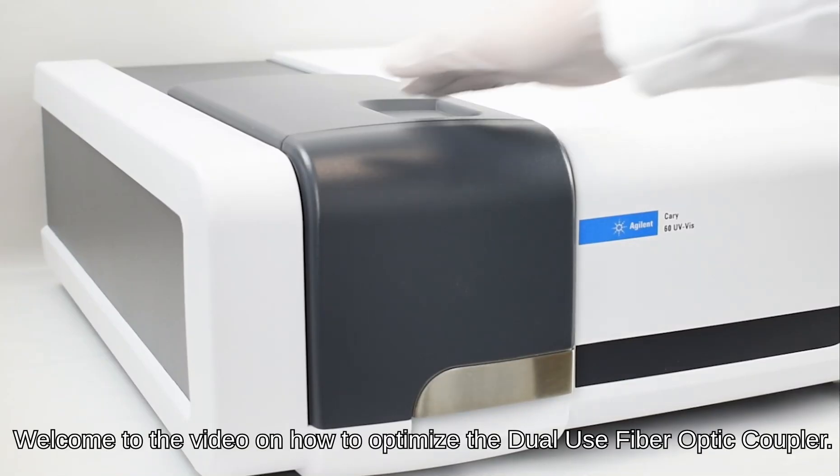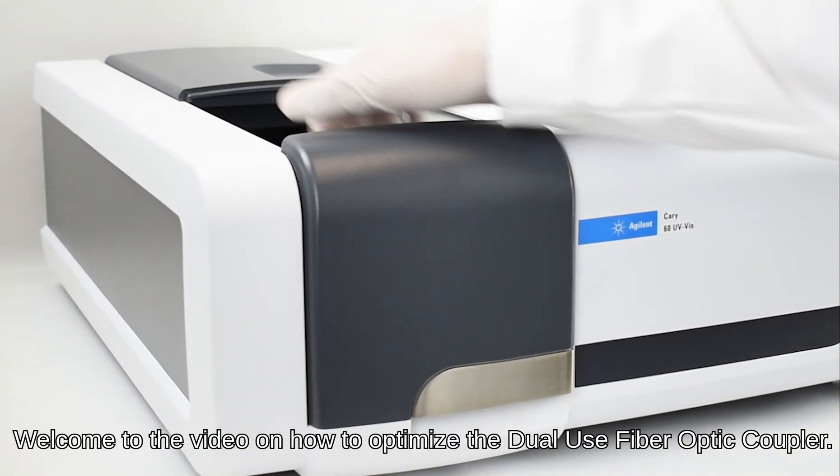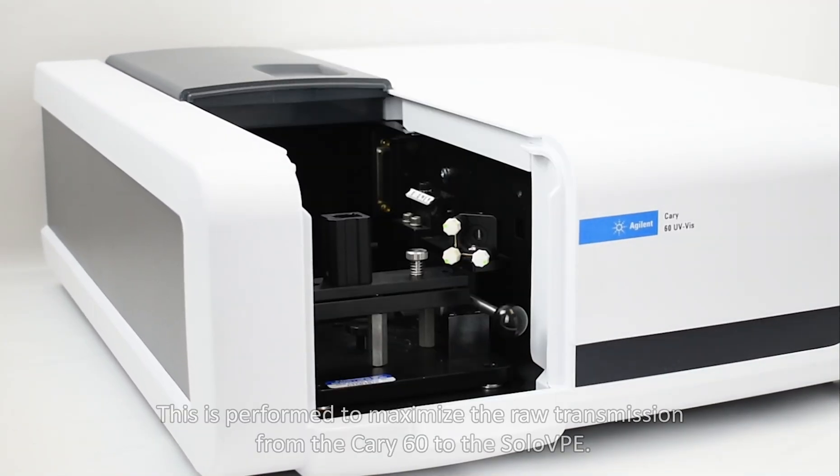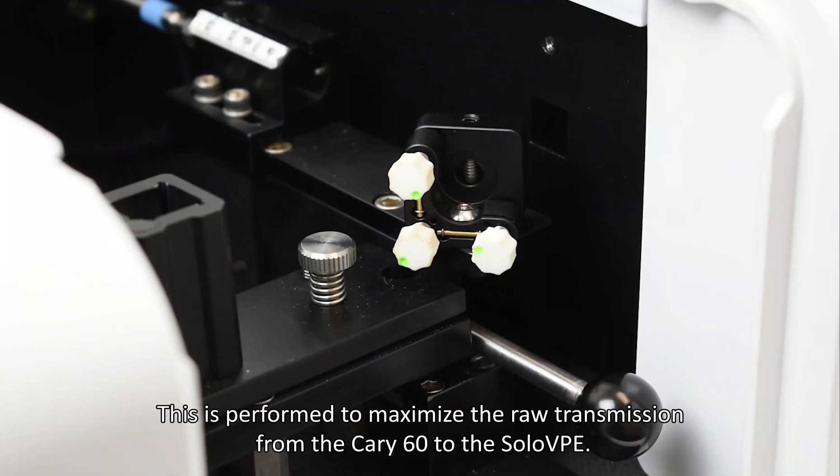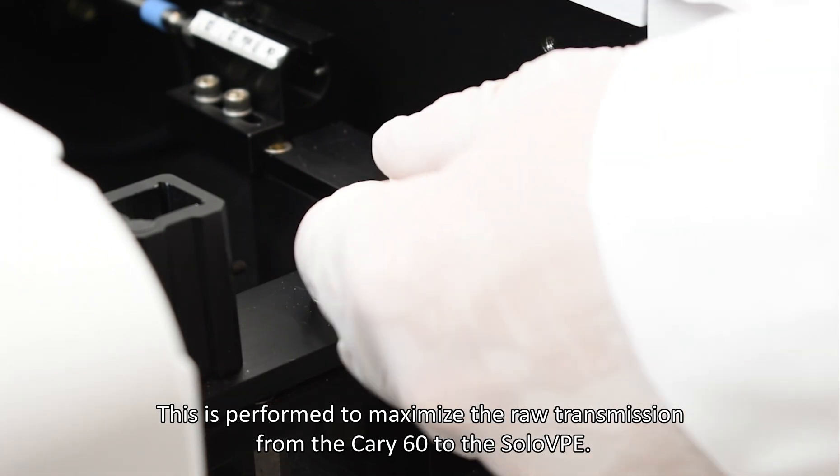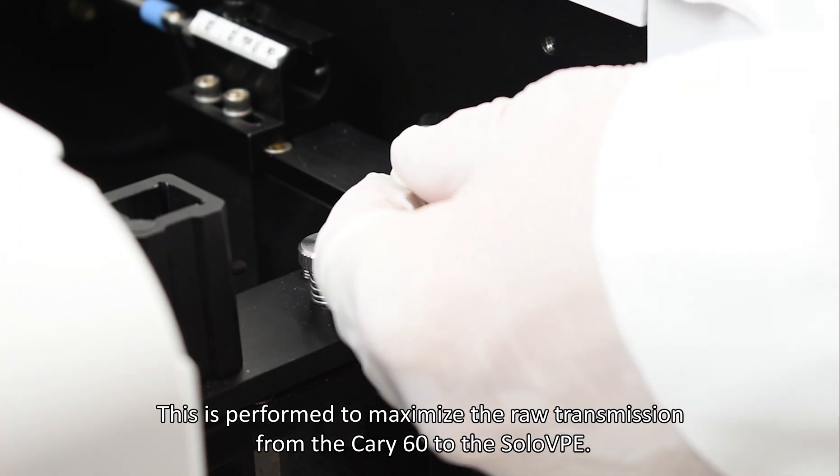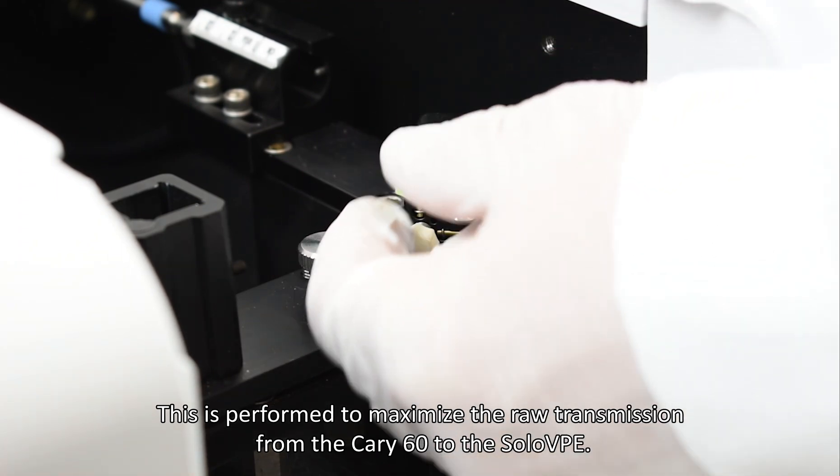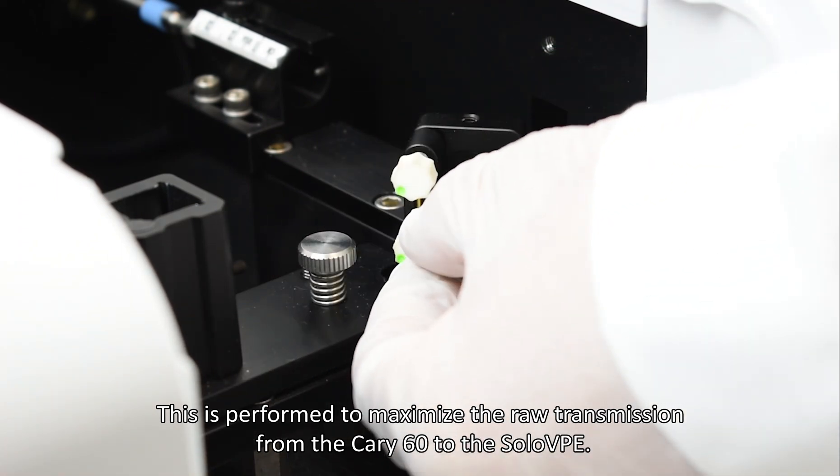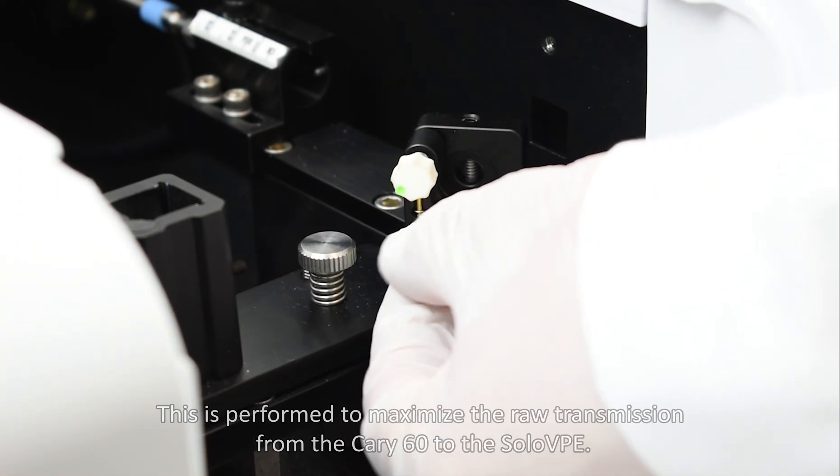Welcome to the video on how to optimize the coupler. This is performed to maximize the raw transmission from the Cary 60 to the SoloVPE.